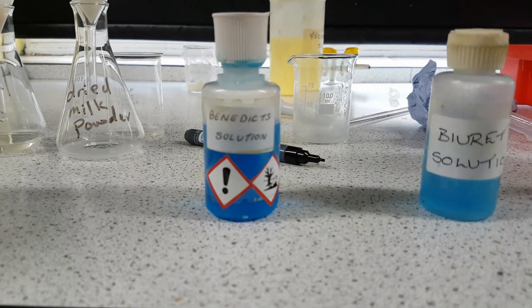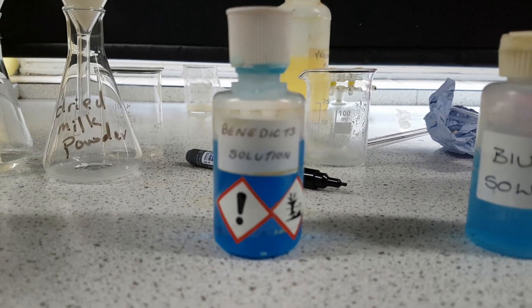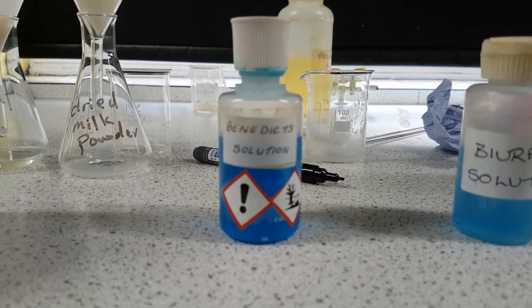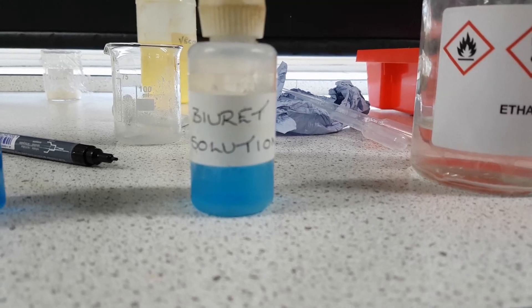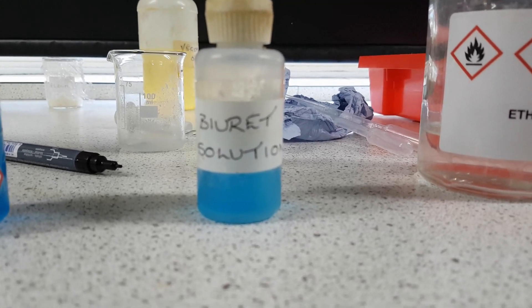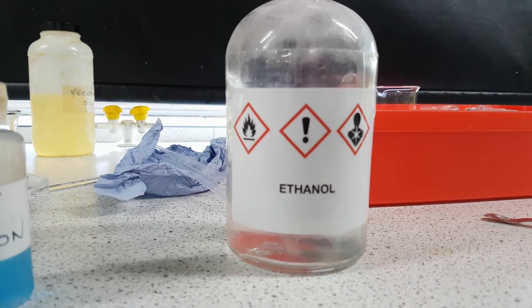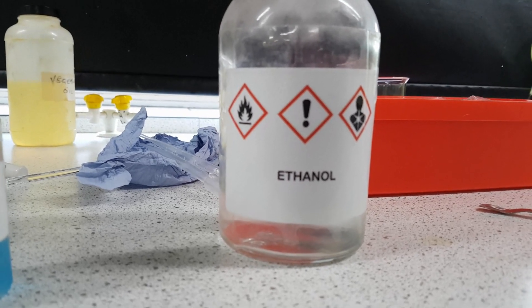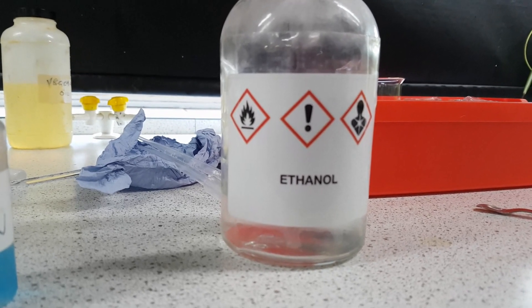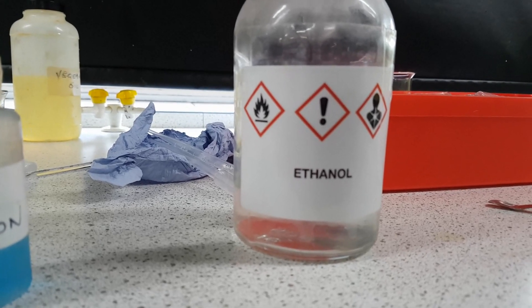The three chemicals that we are using are Benedict's solution, which is a blue colour and tests for simple sugars. Then we have Biuret solution, which will be testing for proteins. And finally we have ethanol, which will be testing for fats. Ethanol is highly flammable so you want to avoid placing it near flames — we probably won't be using Bunsen burners; I'll show you an easier way to do this.